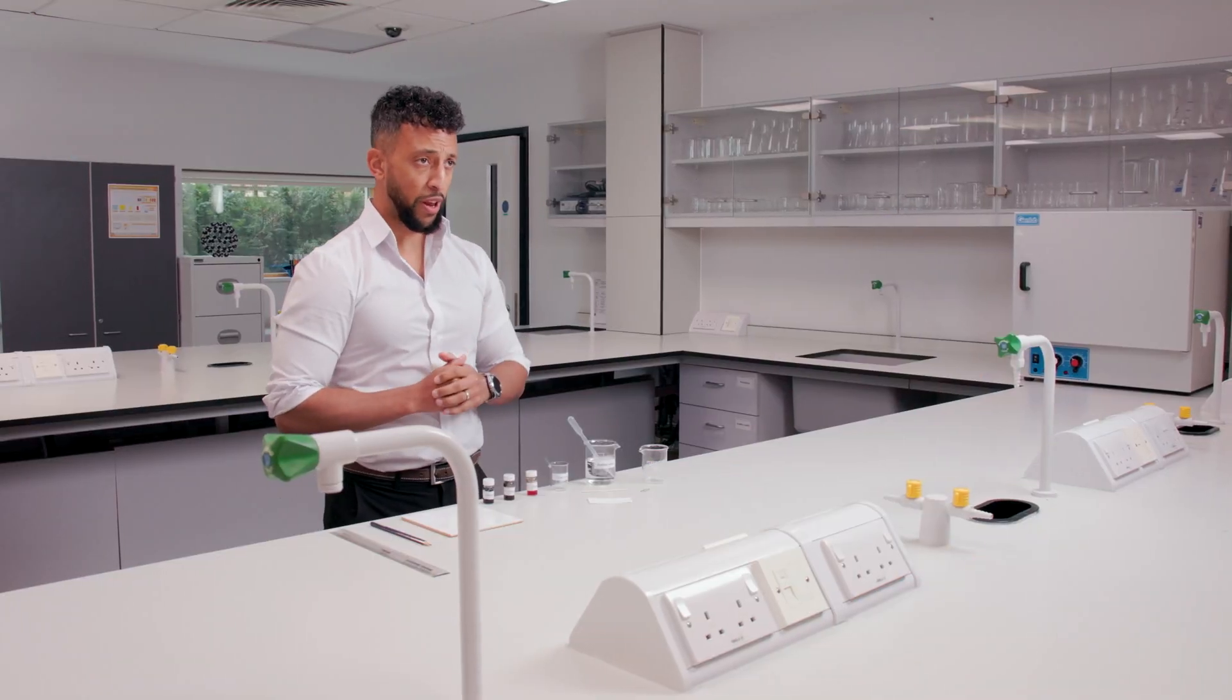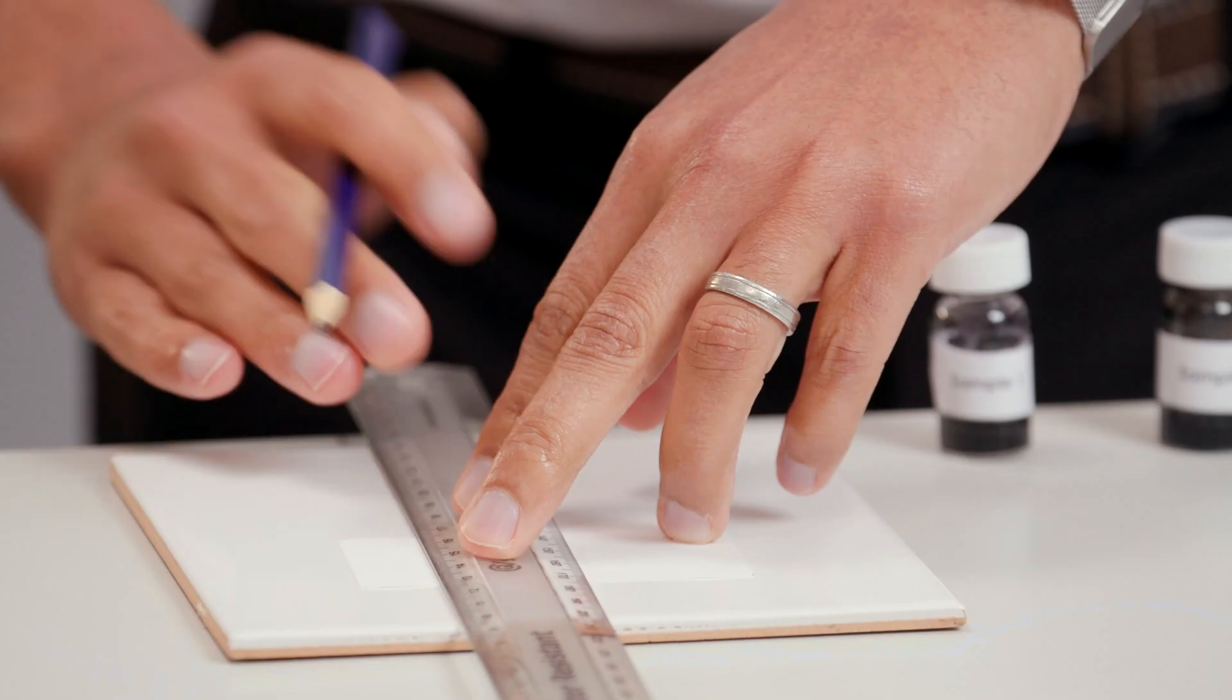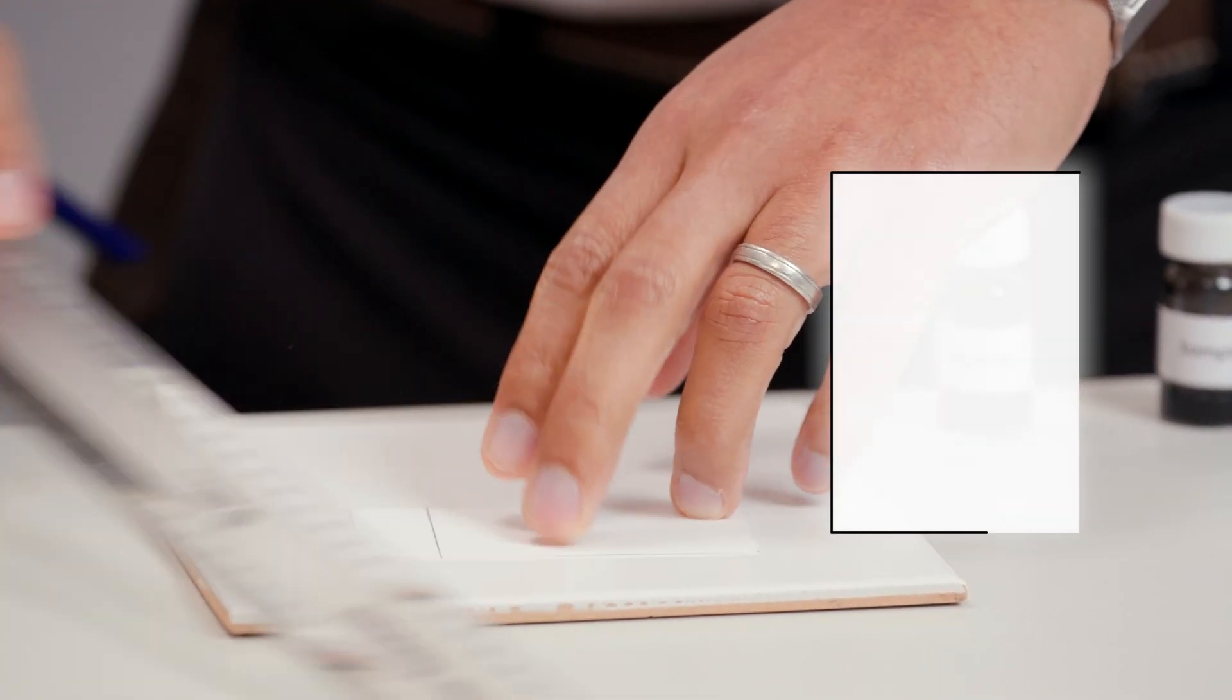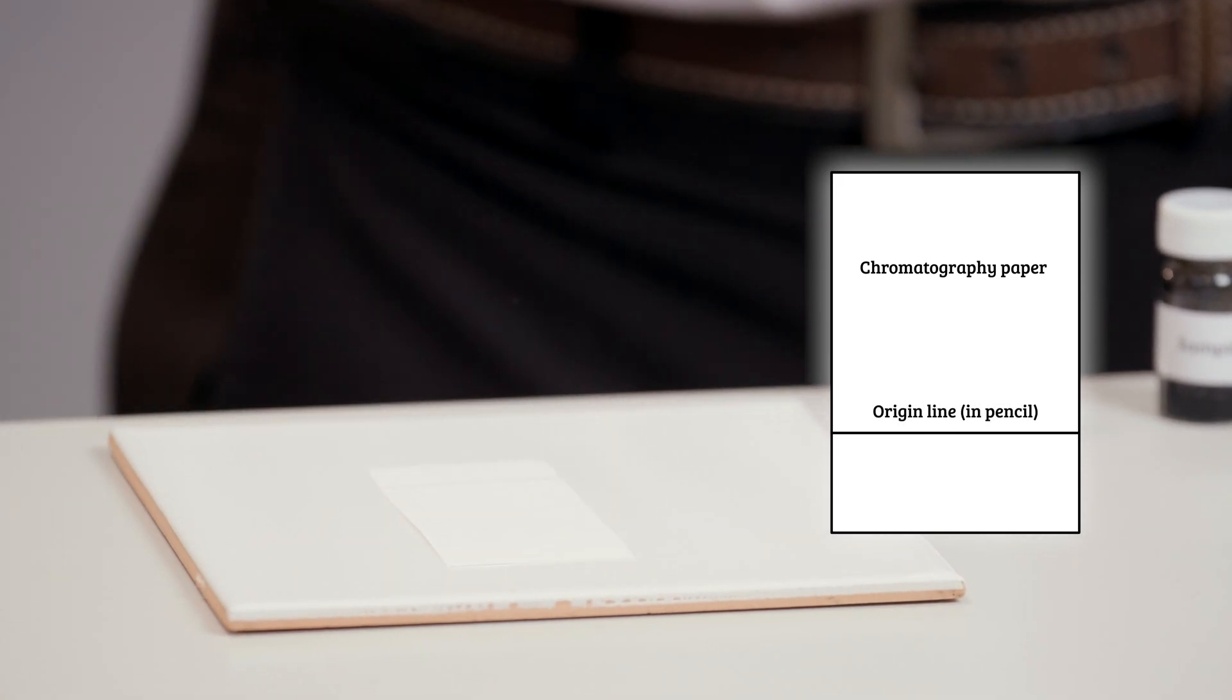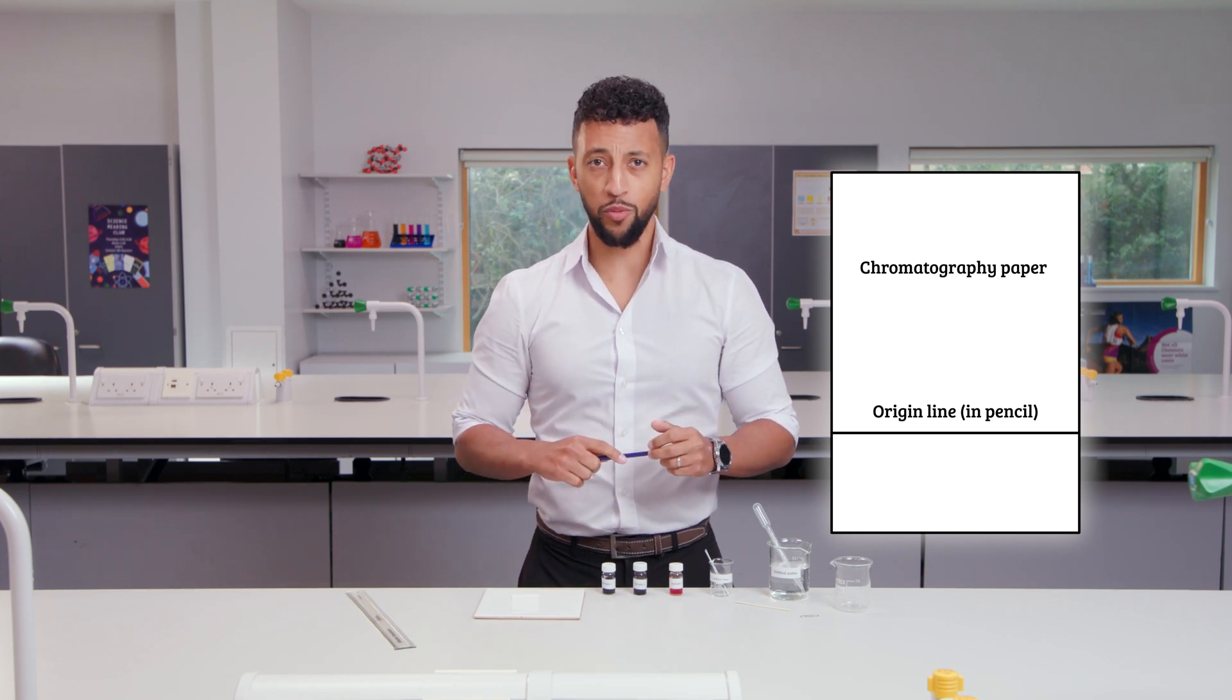First, draw a pencil line a short way from the bottom of the paper like this. This is the origin line. The pencil is not soluble in water so it won't affect the experiment. You'll find out why this is important in a moment.